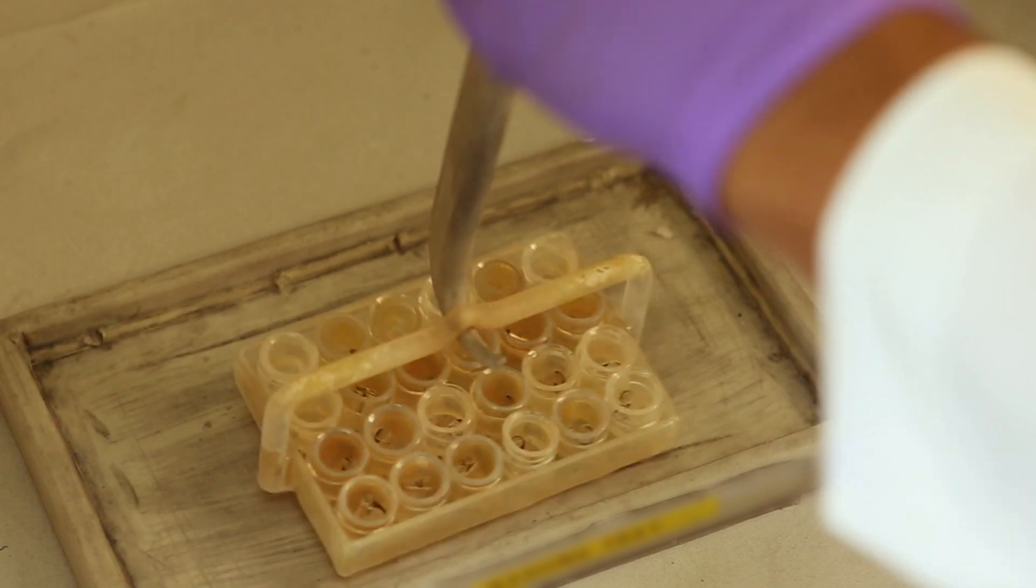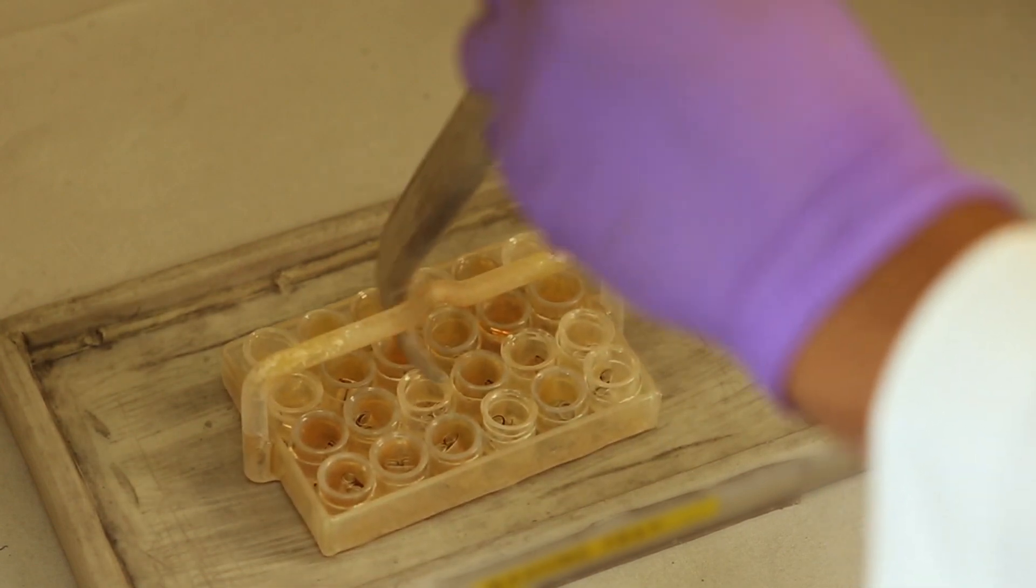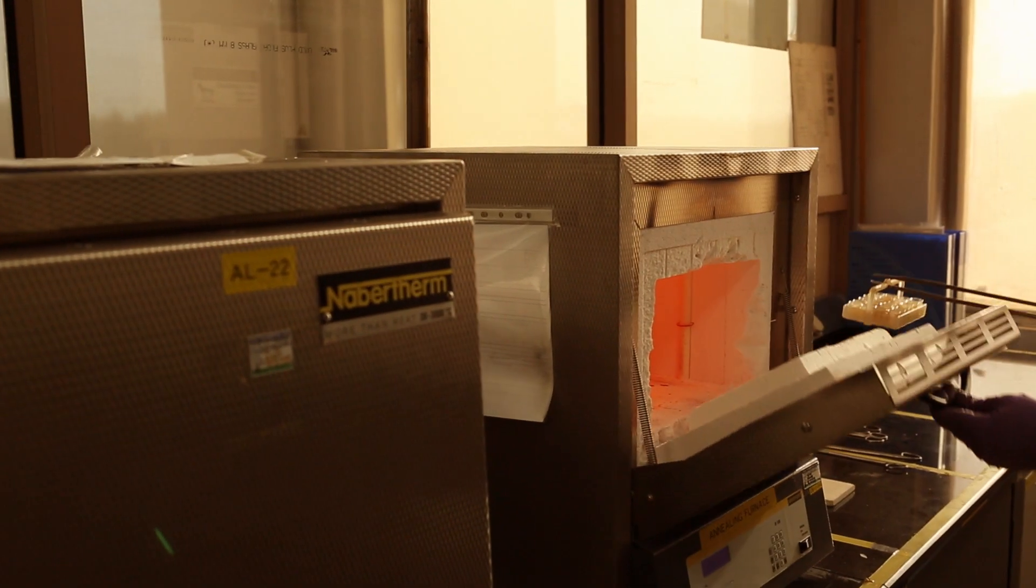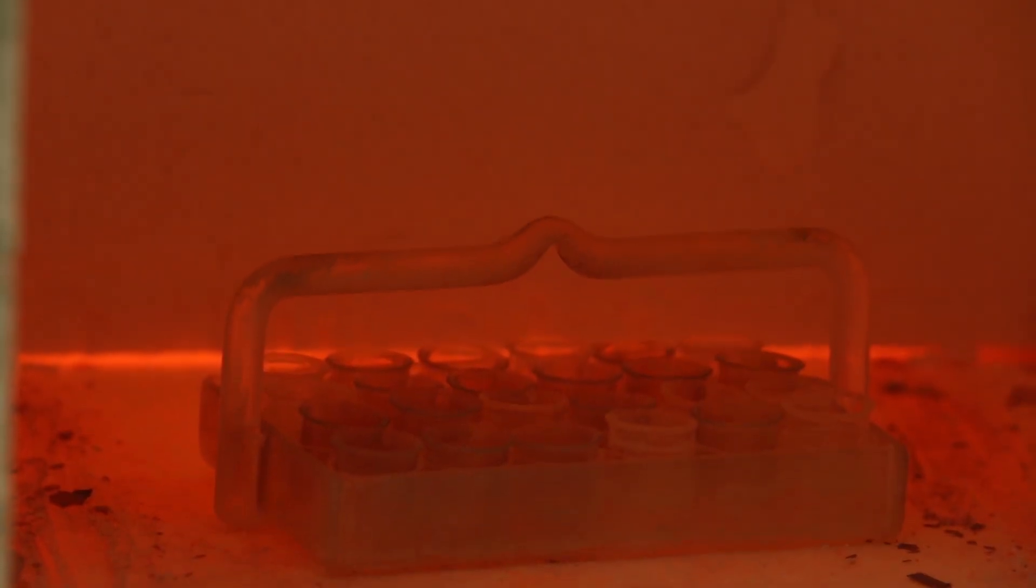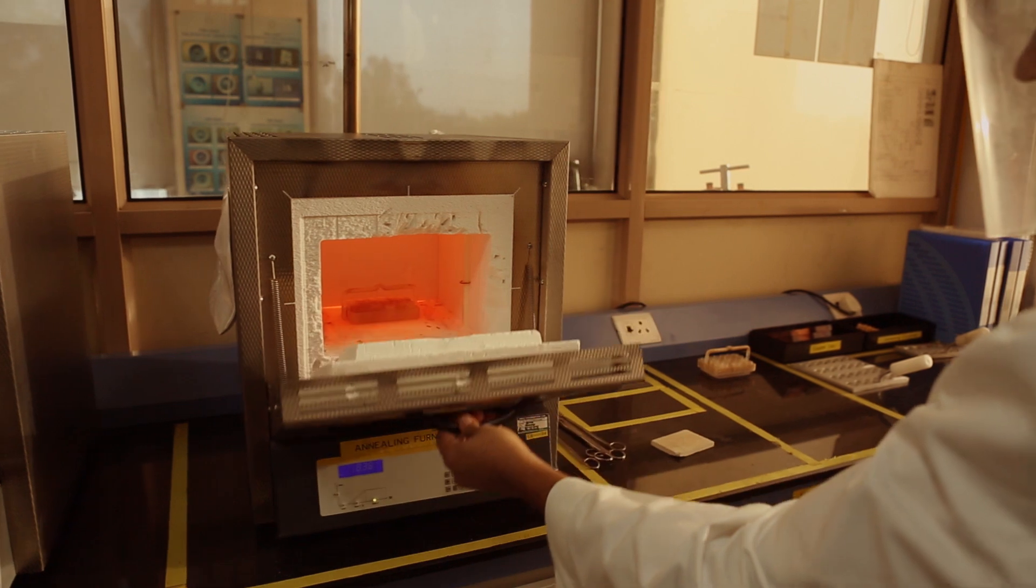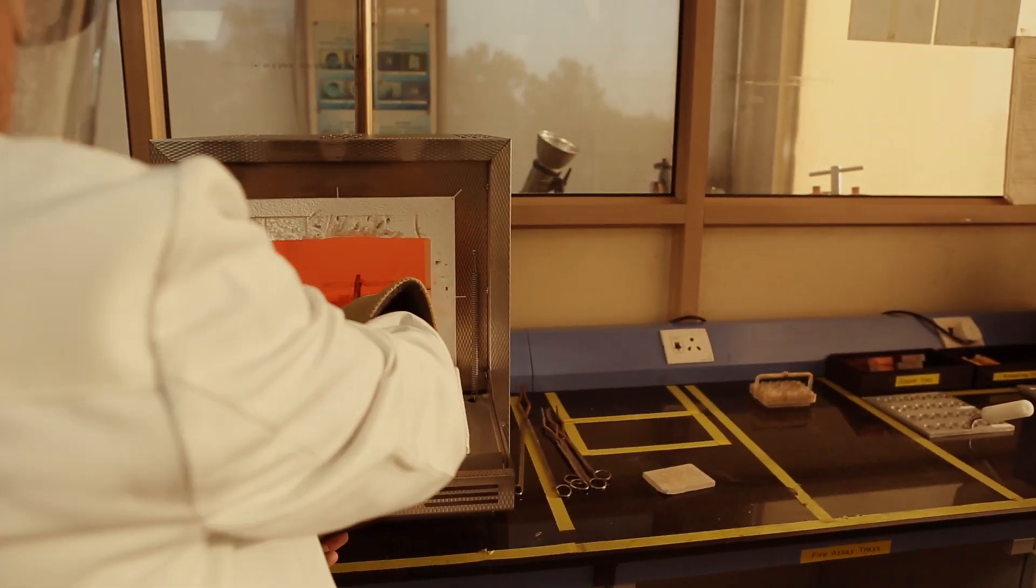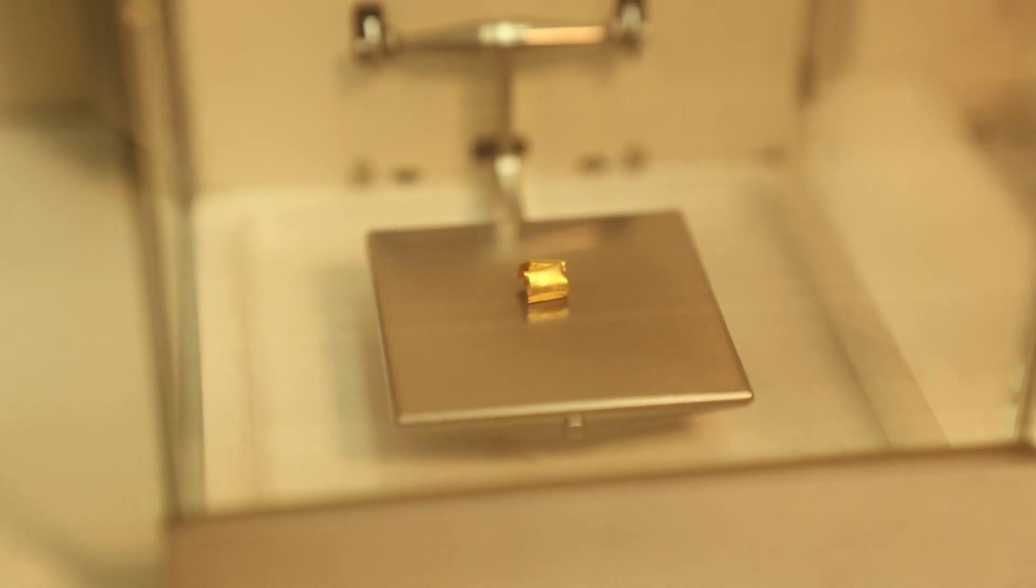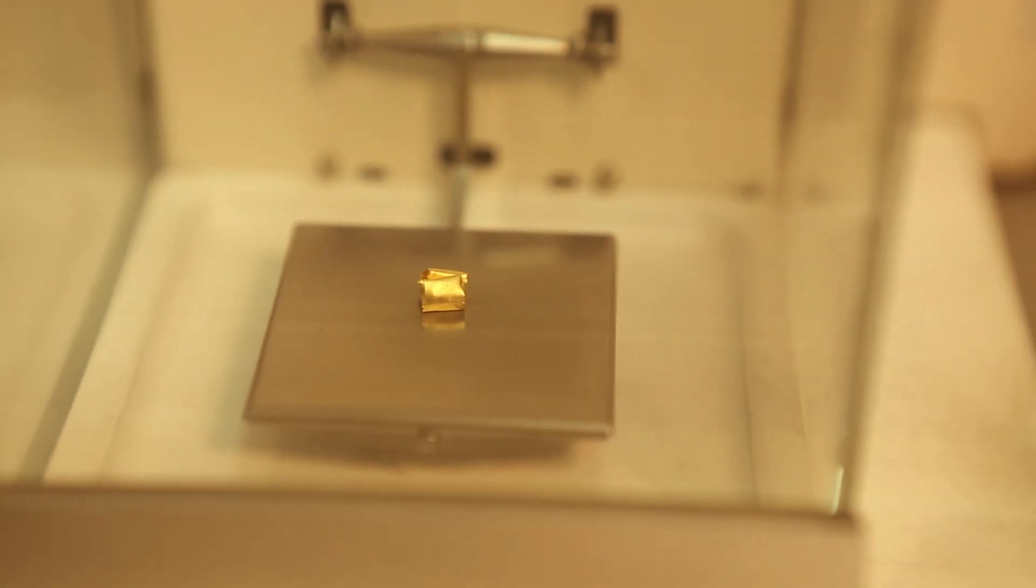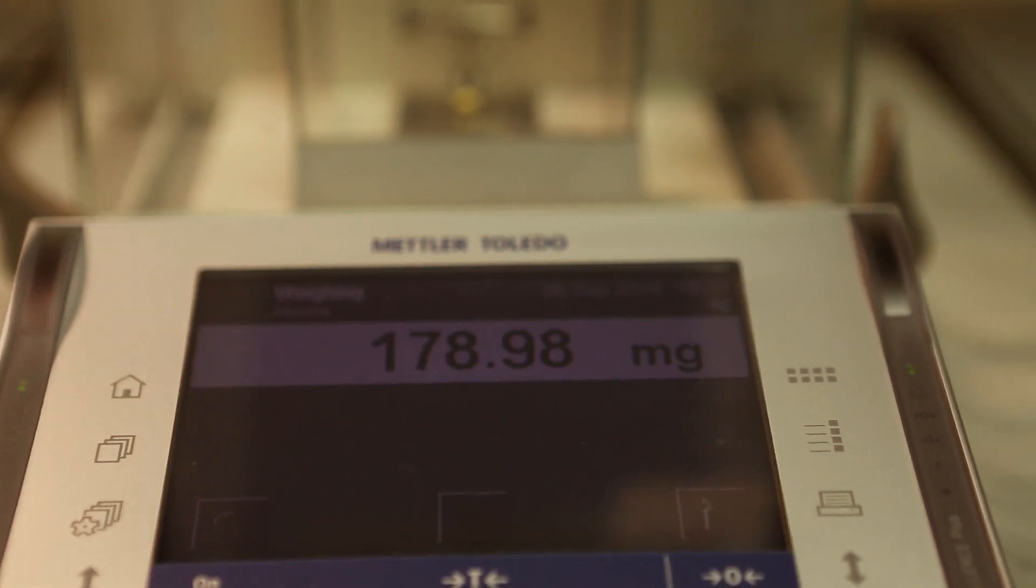The washed gold cornet is left to cool and dry. It is then subjected to annealing to make it cohesive, homogeneous and rigid. It is cooled again and weighed. This completes the fire assay process.